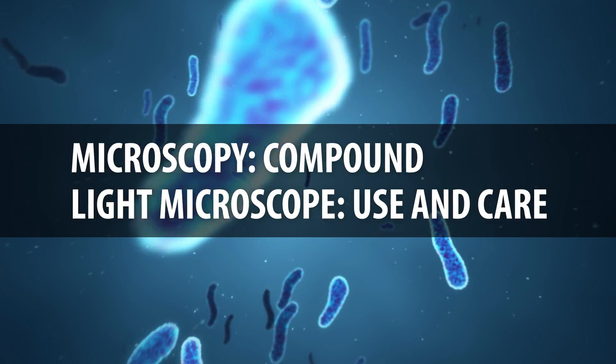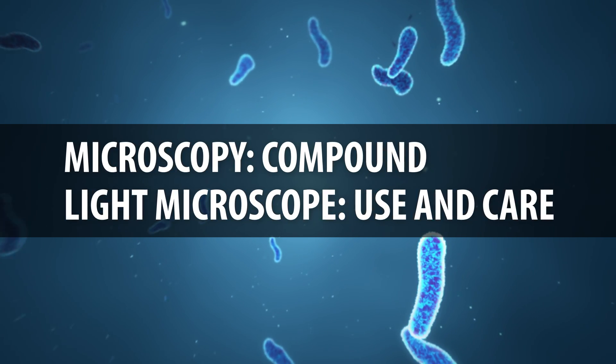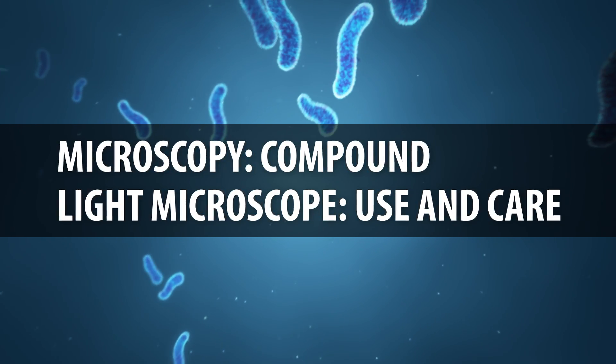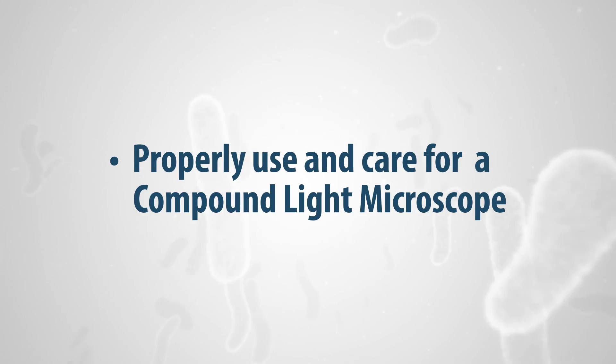Microscopy. Compound light microscope use and care. After completing this video you should be able to properly use and care for a compound light microscope, sometimes referred to as LM.